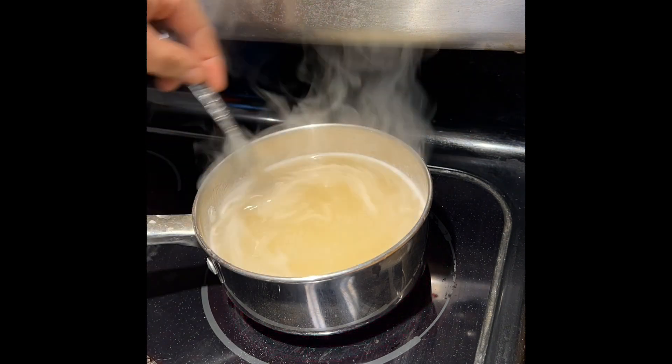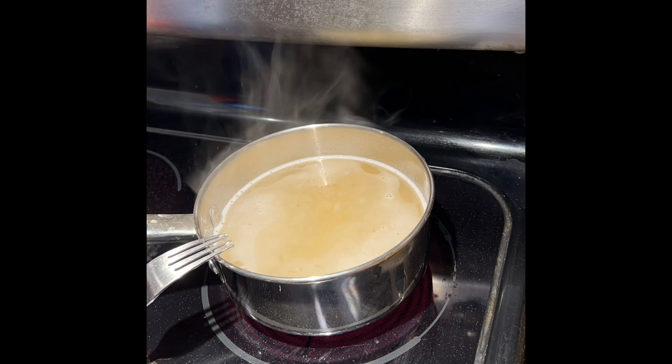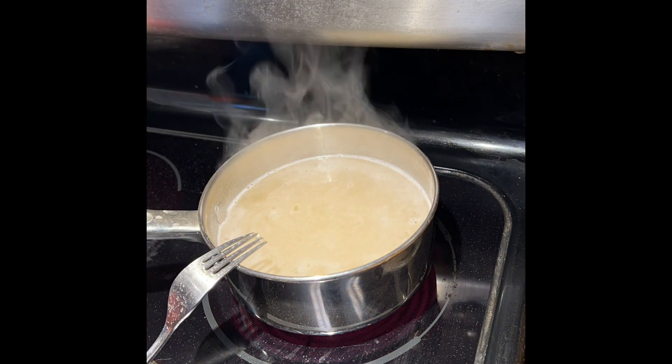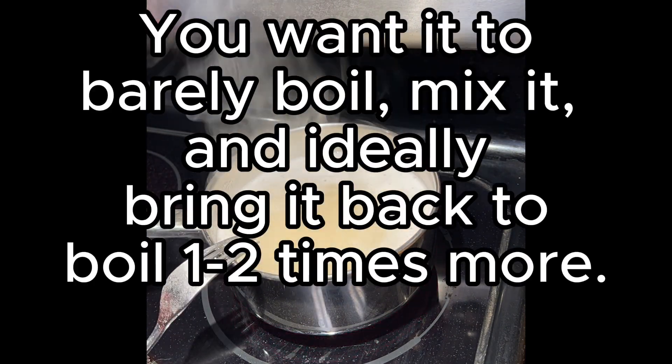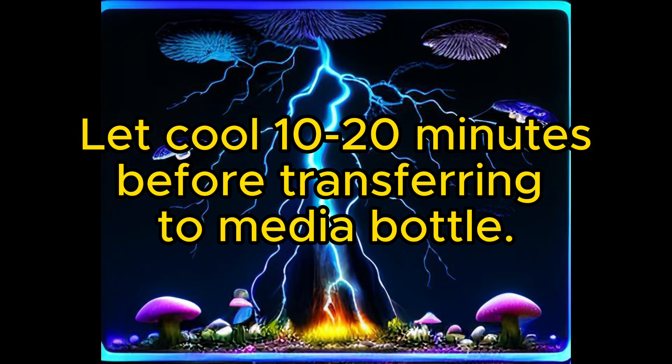You can see again it gets clearer as it goes — it's just the agar melting in. It's odd that a powder melts, but it does dissolve into the liquid, and you want it to almost boil over a couple of times to get it perfect.